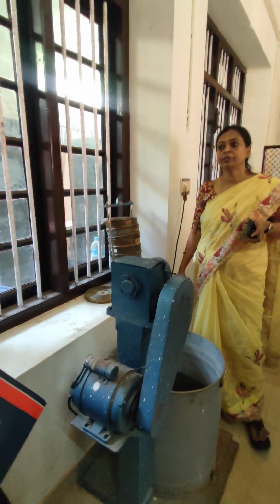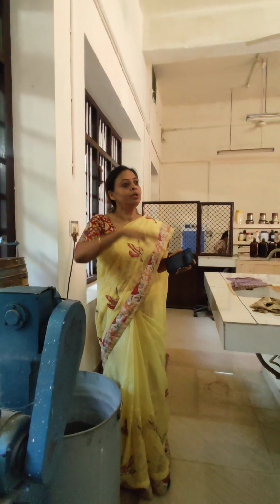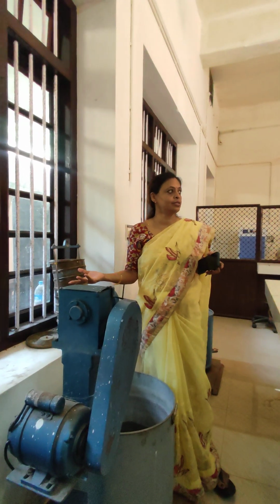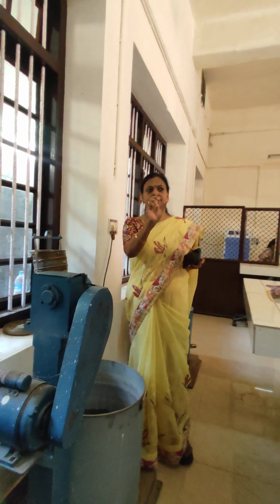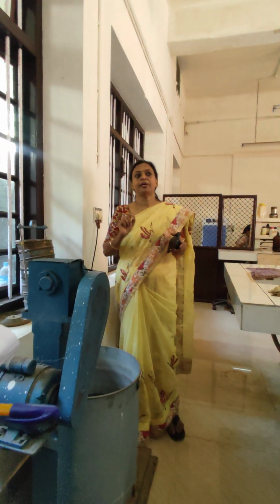The quantity of soil and the percentage will be worked out, and the total should come to 100. When you are taking 100 gram of the soil, you should get 100. So that is the principle of the Yoder apparatus. This is called the Yoder's apparatus, for the particle size distribution. Each and every sieve will have a different size, and you will get different sized particles, and you can calculate the percentage.